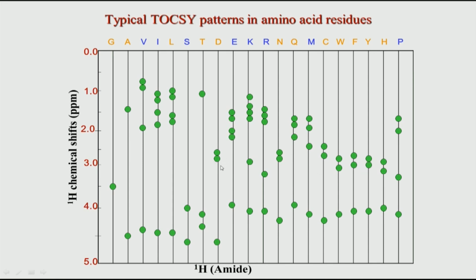And then these amino acids like glutamic acid, lysine, arginine, isoleucine and so on have beta, gamma and delta protons as well, and therefore we use the term long side chains. But as far as our interpretation of NMR data is concerned, we will not worry about these nomenclatures, we will simply use the names directly.